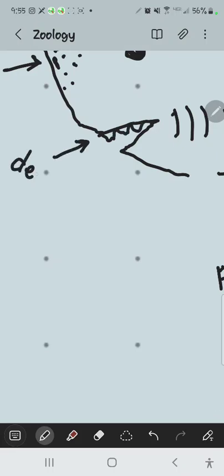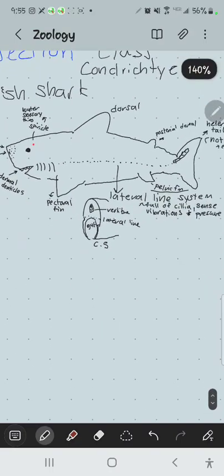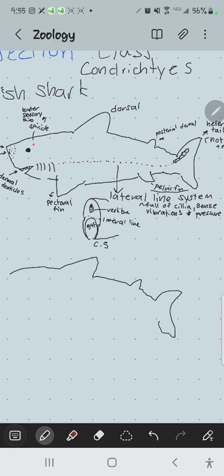Okay, so for the shark dissection, these should already have an incision probably between the pectoral fins and probably at the cloaca between the pelvic fins. And what they do is these have been injected with latex. I think the arteries will be red, the veins will be blue, and then the hepatic system, the liver system, will probably be yellow.